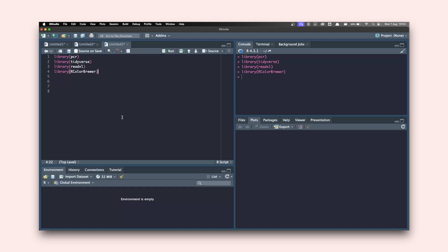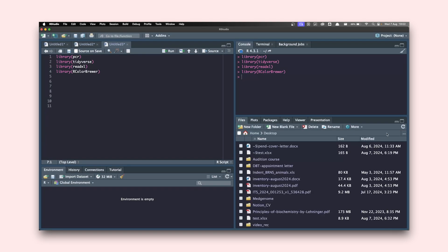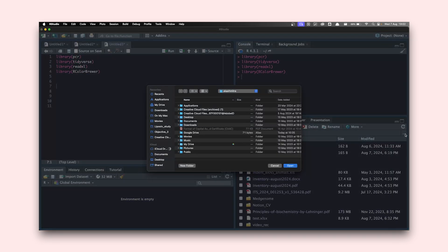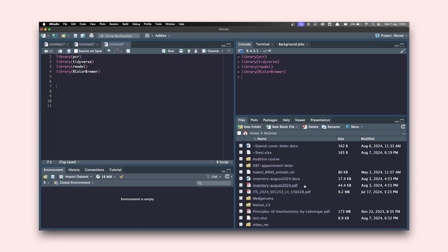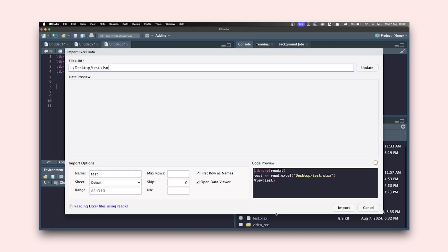Next we can start importing the data — the Excel file that we have. To do that go to Files, click the three dots, and navigate to the location. This will open the file finder. Mine's on the Desktop, so I click on test.xlsx — this is an Excel file — and go to Import Dataset.